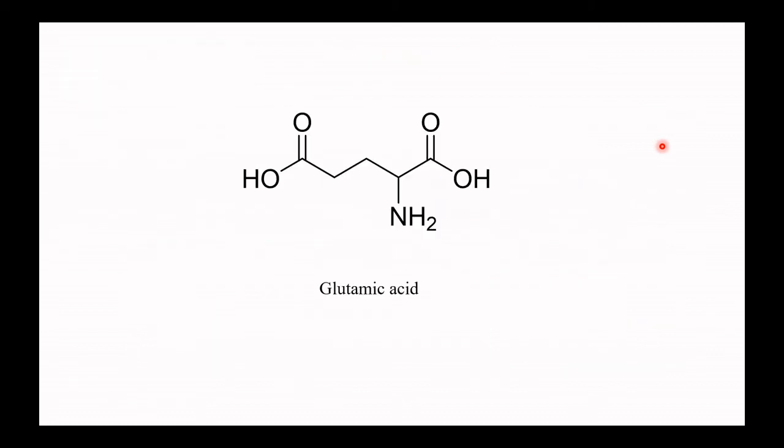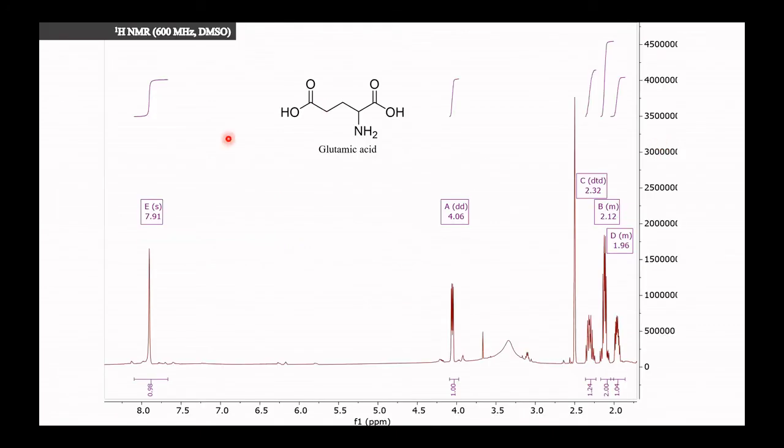Let us see some examples, and I will focus on alkaloids. Alkaloid, this is a proton NMR. Now, you will remember, here is the aliphatic region until 6.2. After that, aromatic region. And if the peak is broad, it means functional group. So let us see what we will see.